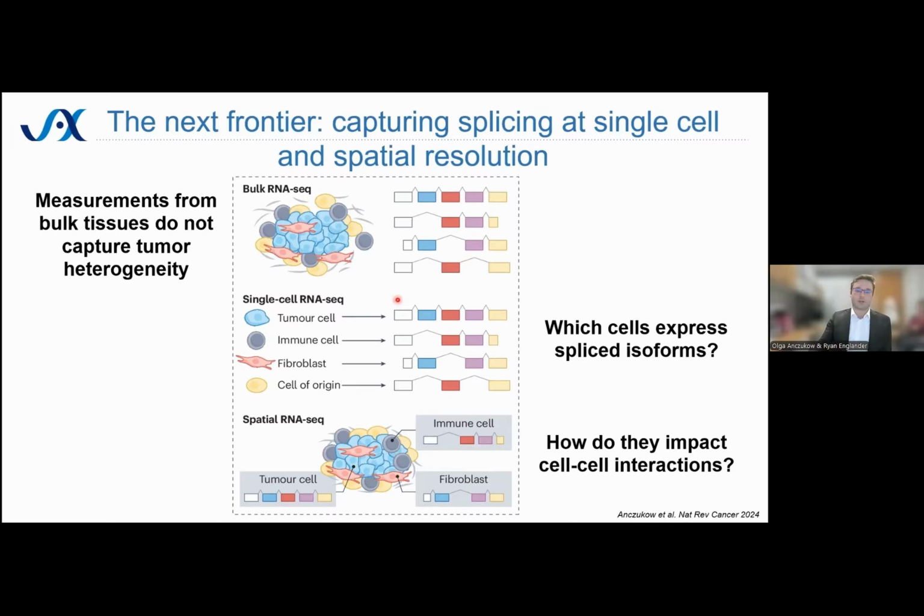And so we are incredibly excited to look at single cell long-read RNA sequencing and get full-length isoforms from single cells, and also work with spatial RNA sequencing to tell us where those full-length isoforms actually are in a tumor or in other disease states, to help us deconvolute what is happening in cancer and identify new targets for treatment therapy and mechanisms to overcome resistance.